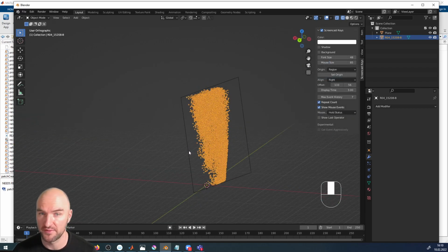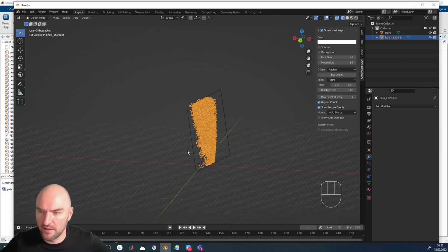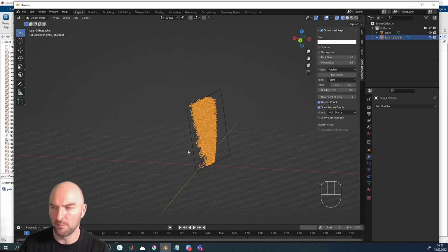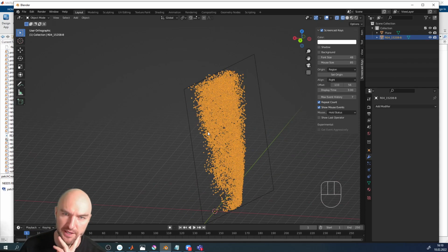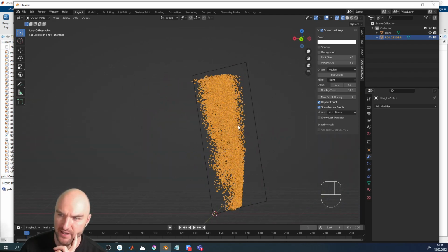That's a demonstration effect. I have no idea why it doesn't import the PLY format, because when you import a PLY format, it will also import the mesh properties, and it will know that it has vertex coloring. So you will have those colors that you've allocated in MATLAB.